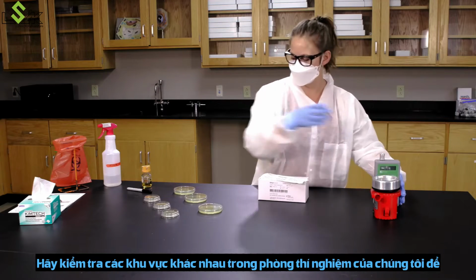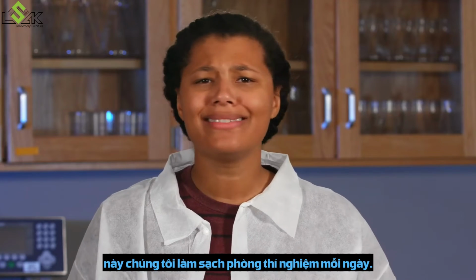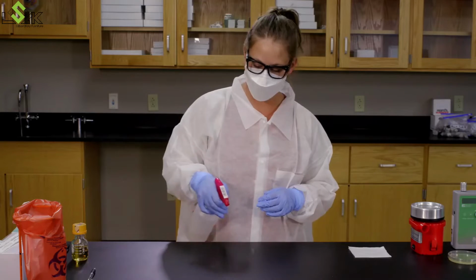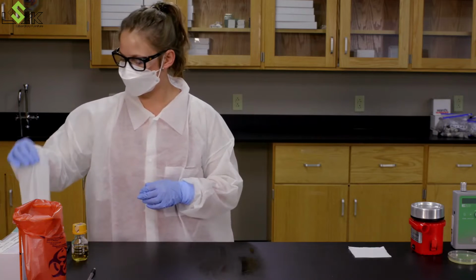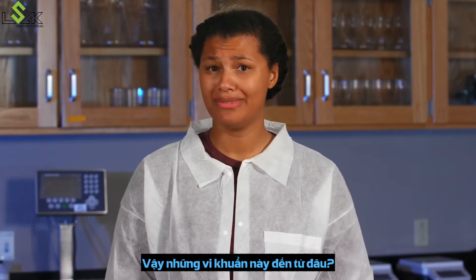Let's test different areas of our labs to see if microbes are present. You may be thinking, hey, we clean the lab every day. It's one of the first things we learned in this class. And you're right. So where do these microbes come from?